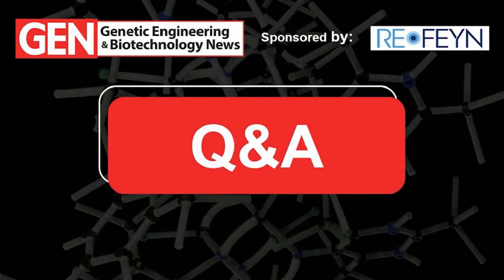All right, thanks everyone for joining us for this Q&A session. Svea is on hand. You guys have some excellent questions that have been coming in. Keep them coming. We're going to try to get through as many of them as possible. So Svea, we start our first question. One of our audience members would like to know, what is the mass range that the Samux MP can measure?